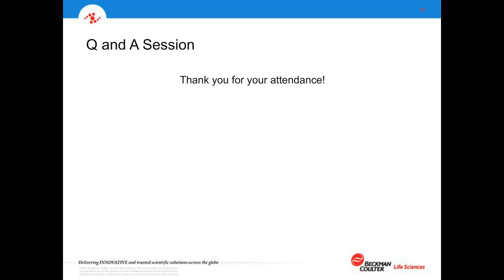And in some ways, you might almost say it's more important in reality, because you want to know that as you use that instrument to evaluate your process day to day or week by week, your area continues to meet that. And again, by using 21501-4, you have a very consistent method of looking at the health of the instrument each year or every 6 months. So you have higher assurance that the values you're getting for your area as you work day to day or week to week or month to month taking those samples do in fact meet your requirements for your process. So yes, it's in the document for monitoring, and regardless, it's probably good wisdom.